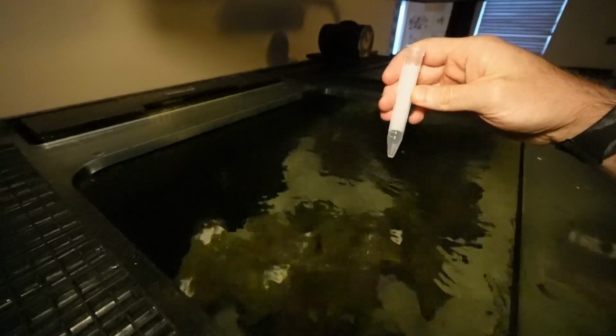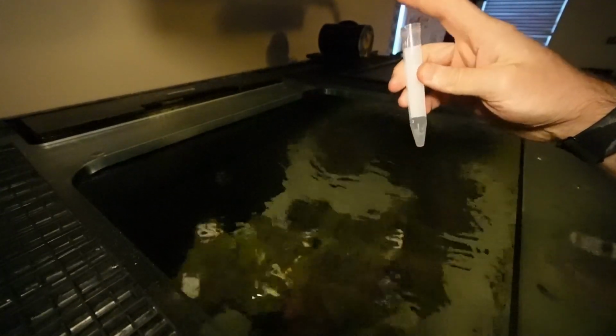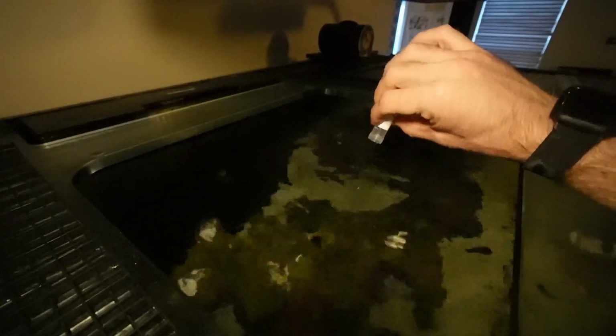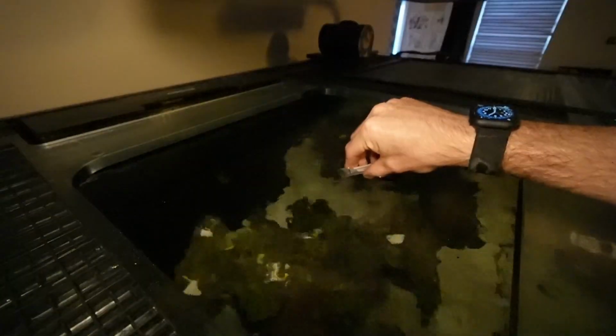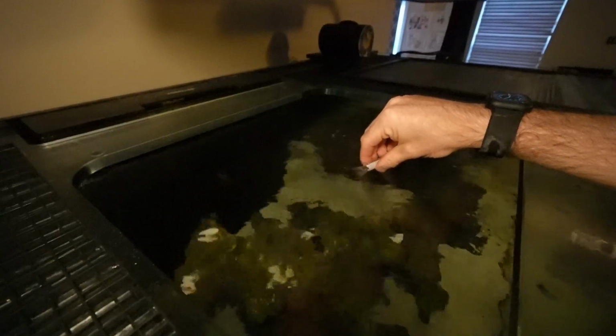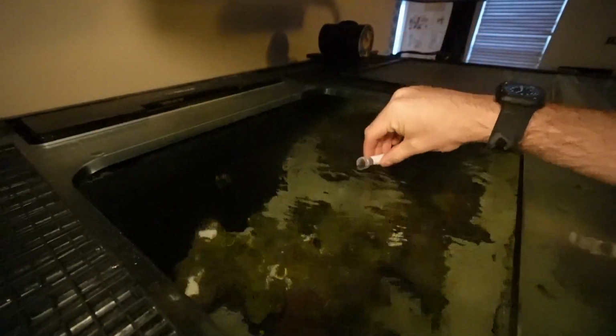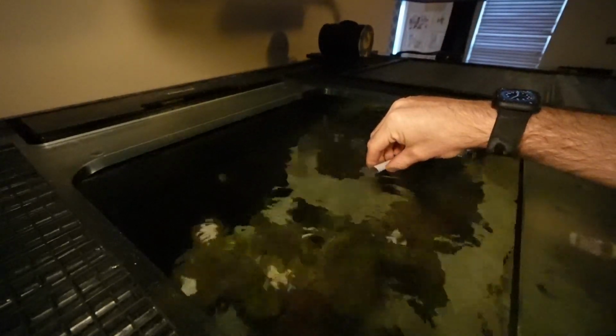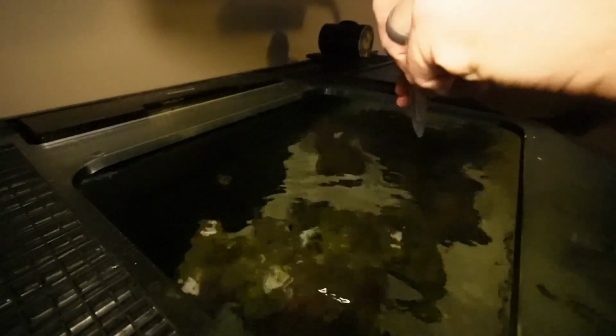If you end up using this test, confirm on your instructions that all 3 are for your water sample from your reef tank. So we're gonna rinse this out 3 times like it recommends. We got 1 filled, 2 filled, and 3 have been filled.